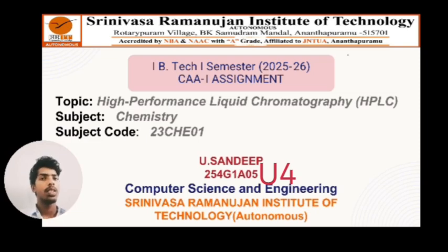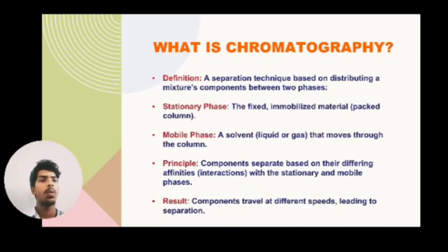My video presentation is High Performance Liquid Chromatography, the short form HPLC. What is chromatography? The definition is a separation technique based on distributing a mixture's components between two phases. The component separation between two phases is called chromatography. In these, two phases are there: stationary phase and mobile phase.